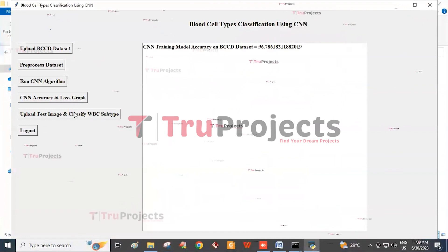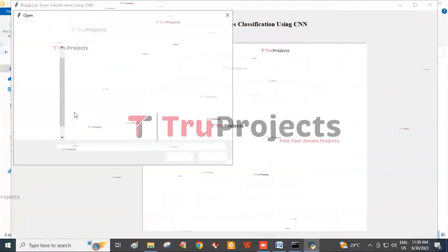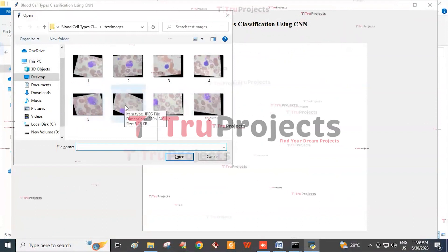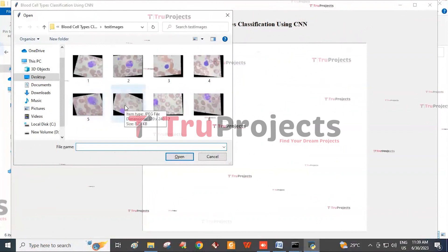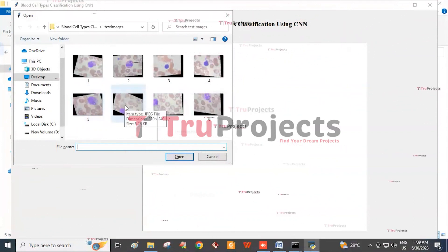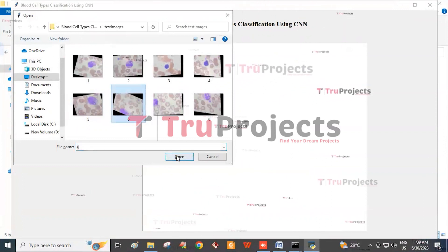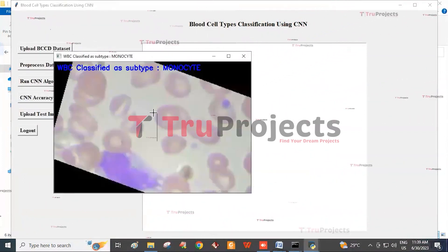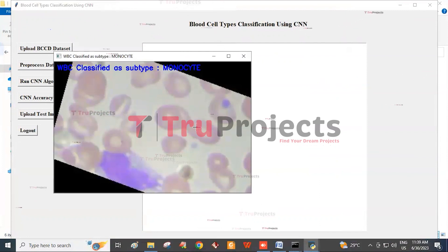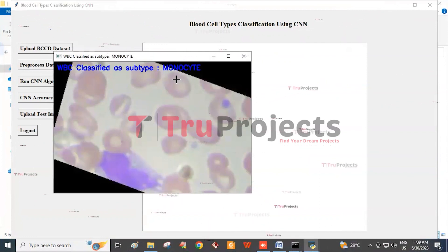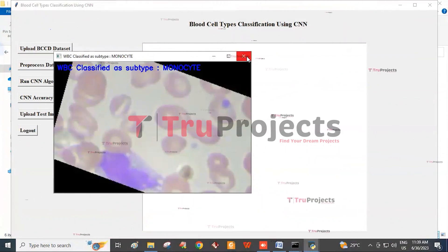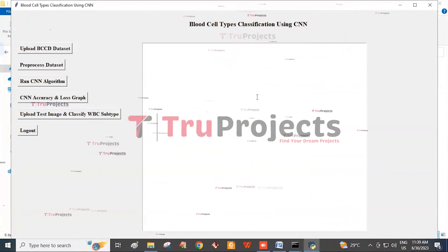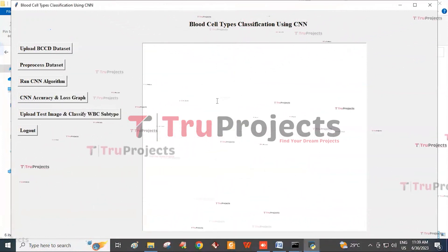Click on Upload Test Image and Classify WBC Subtype. Here a JPEG file is selected as the test image. In this screen, we can see that the uploaded image is classified as monocyte. In this way, users can upload other images and identify the WBC subtypes.